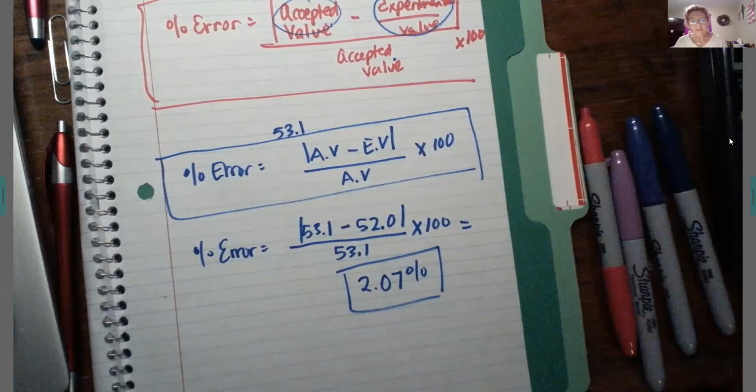So that is pretty much what I wanted to talk to you about for this lab. Let me check my notes. And we will go back through this and we'll go through this discussion again. I'll show you the lab setup and I'll show you the technique for putting the thermometer in there and how to set up everything, because it's your first time and it's really important that you develop some of these lab skills in this particular lab. So thanks for listening, and we'll go over this in class pretty soon.